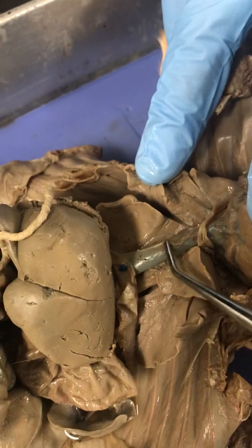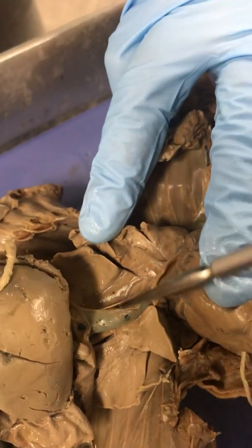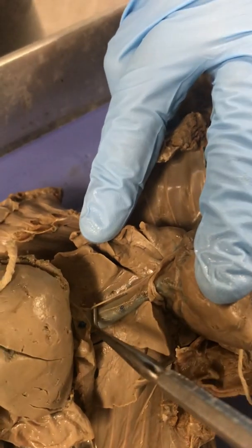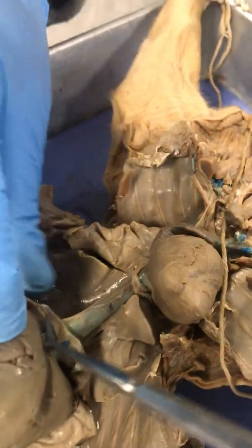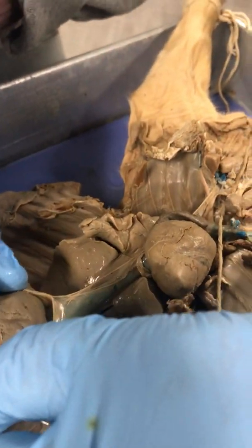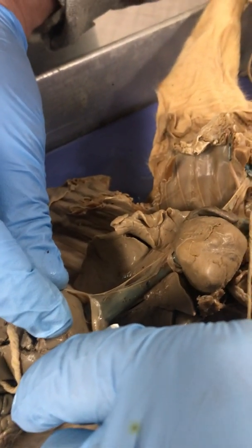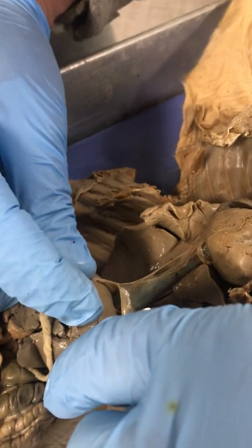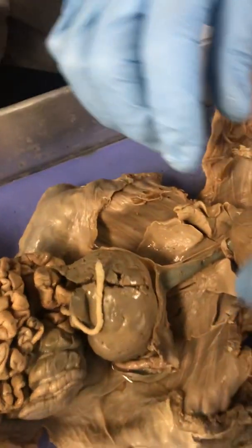And then remember that little white thread that is running down along the surface, I think it's this one. That would be the phrenic nerve. And it would be innervating the diaphragm. So this is what conveys signals from the respiratory centers in the brain to the diaphragm to cause inspiration of air. You all right with this?